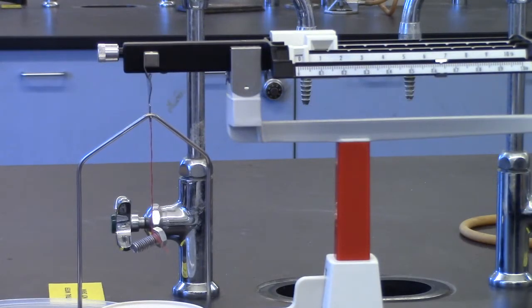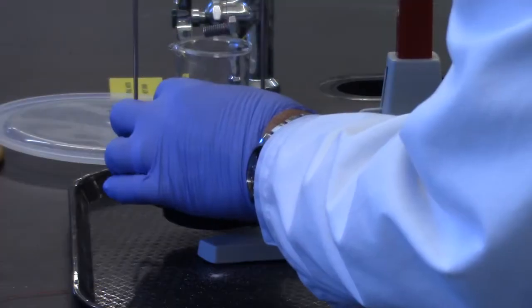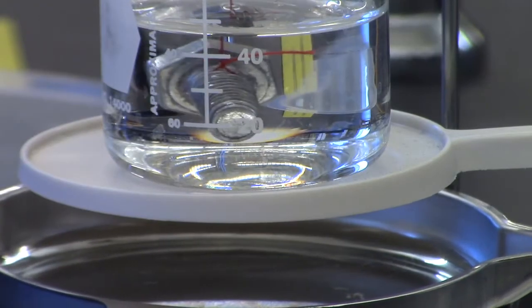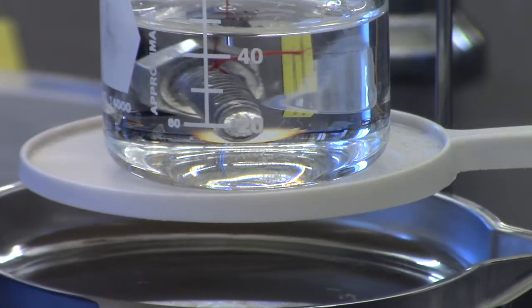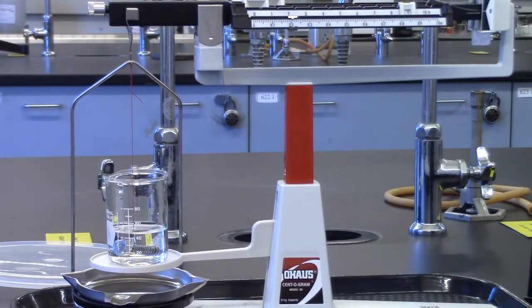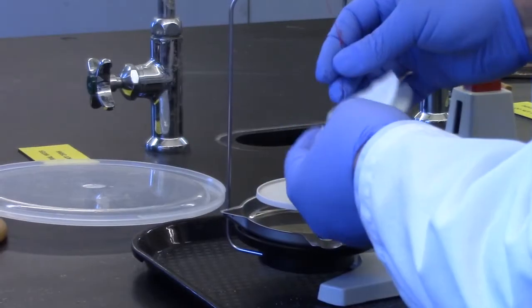First, suspend the sinker from the balance and weigh the sinker in air. Record the mass. Next, place the beaker with distilled water on the platform. Submerge the sinker in water, taking care to ensure the sinker is totally submerged and not touching the bottom or side of the beaker. Weigh the sinker and record the mass of the sinker submerged in water. Remove the beaker and pat dry the sinker.